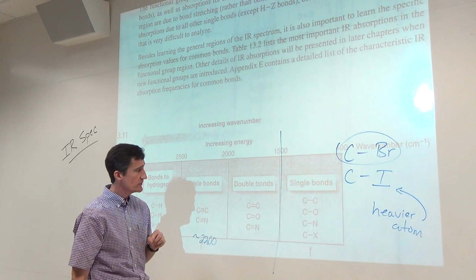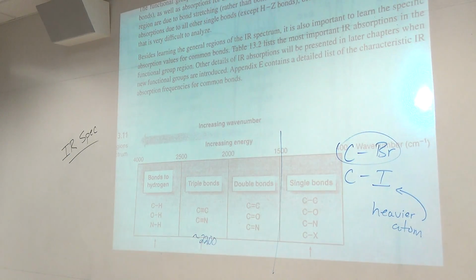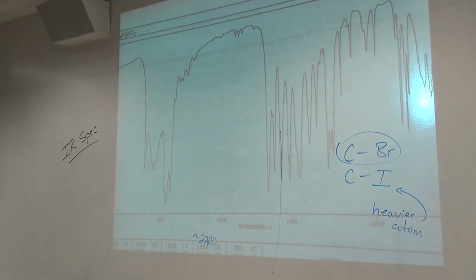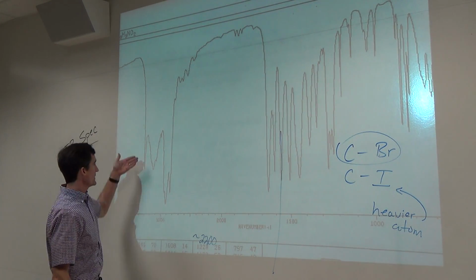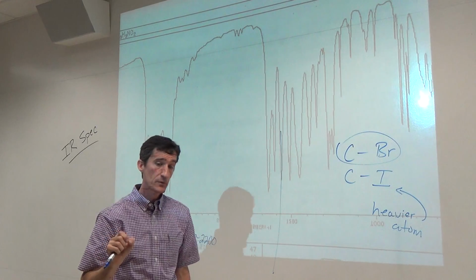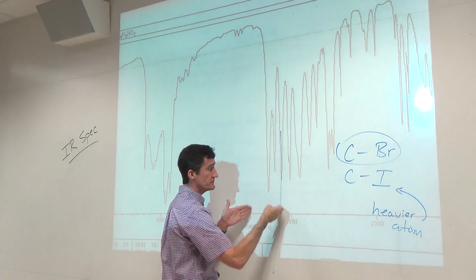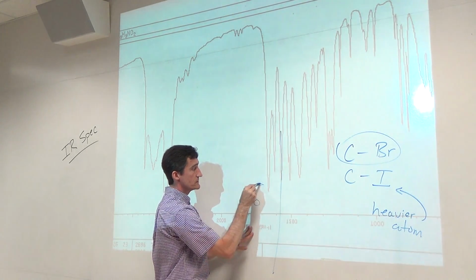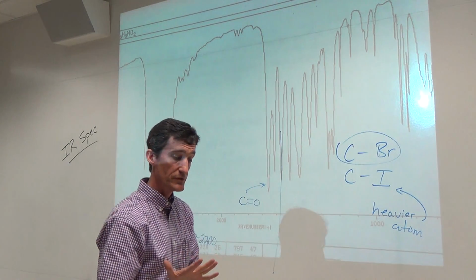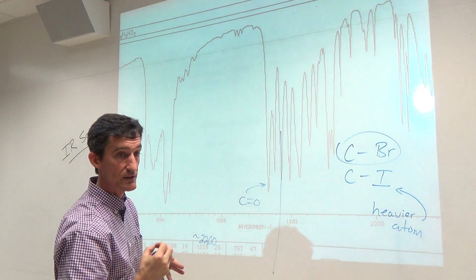We might real quickly look back at acetaminophen. If you remember, it had OH, NH. It's been erased, but do you remember the NH, OH, CH? We will have to clarify what is the hybridization of the carbon we're talking about. We'll see that on the next table. Then you remember your double bond region, and this ended up being the C=O. Okay? So you need to start looking at IR spectra versus tables and seeing that indeed peaks do fall in the appropriate regions, and we can assign these peaks.